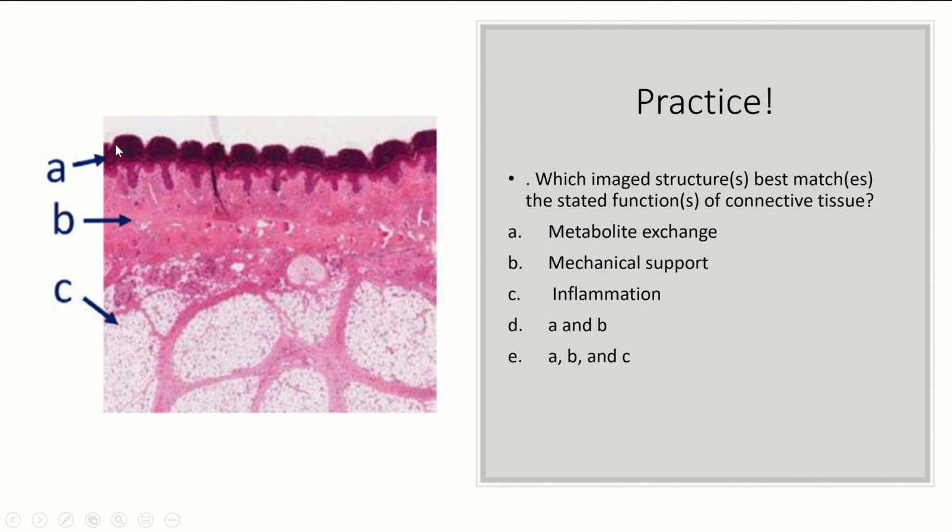This is that stratified squamous epithelium, more than one layer of flat epithelium. This is the outermost part of your skin. Okay, so it's not connective tissue, it's epithelium. So that one's already going to be wrong.